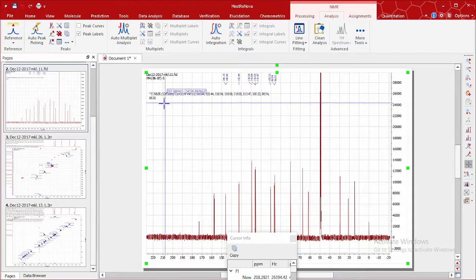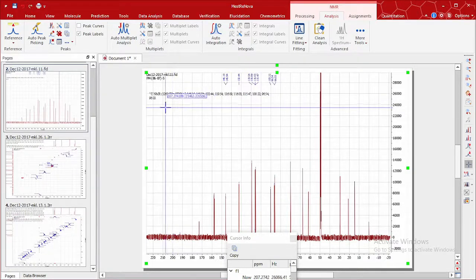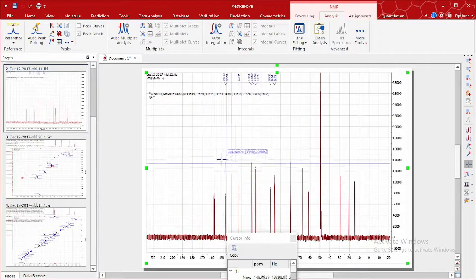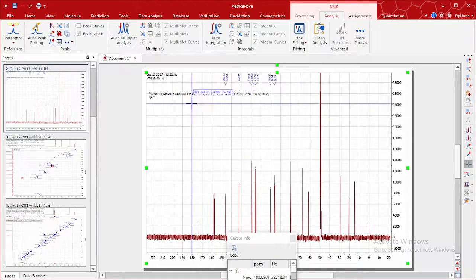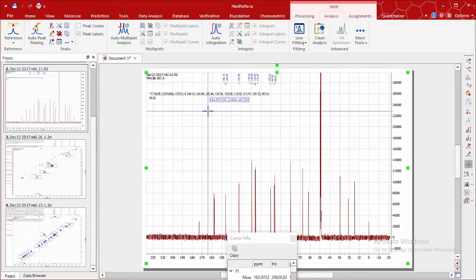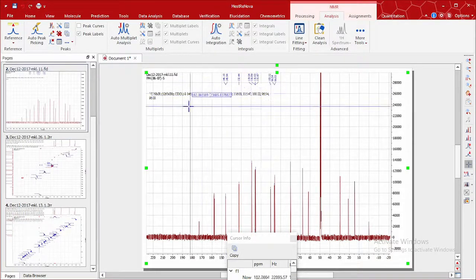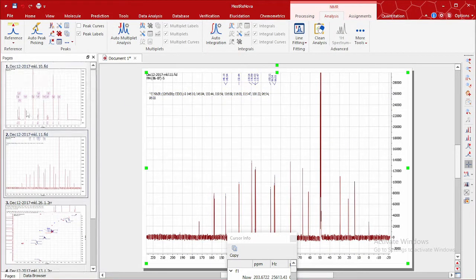It's giving you the next information you are seeing there, which is the capacity of the machine. The next is you can see CDCl3, that is deuterated chloroform. This particular compound is run in chloroform, and it goes on to arrange your peaks in descending order of magnitude. The first peaks there are 146, 145, 132, 119. You can always copy this and use it in any other places you want, such as your Microsoft Word or any other document that might be useful for you.